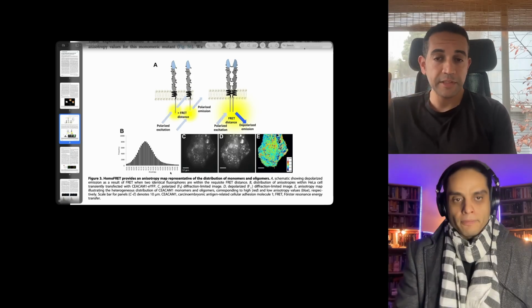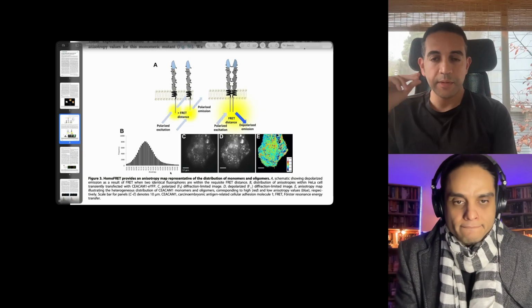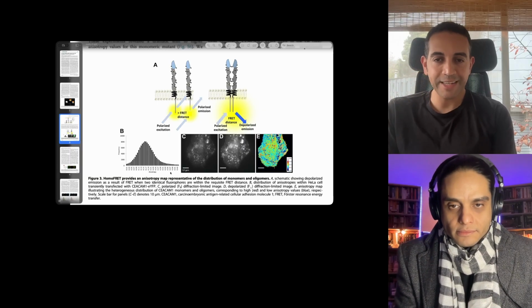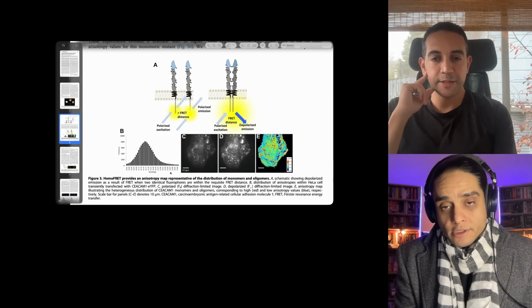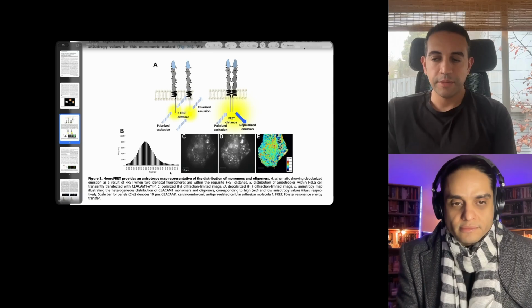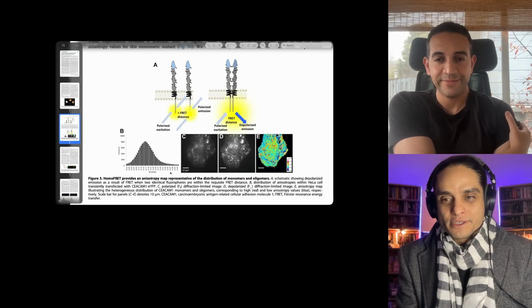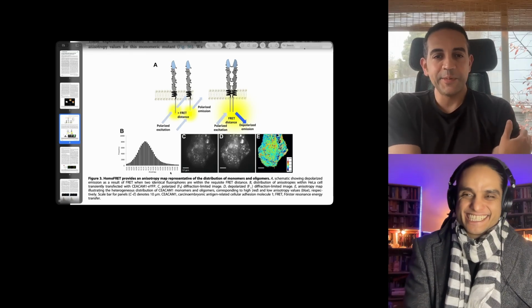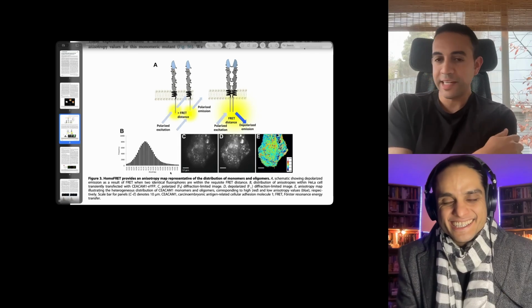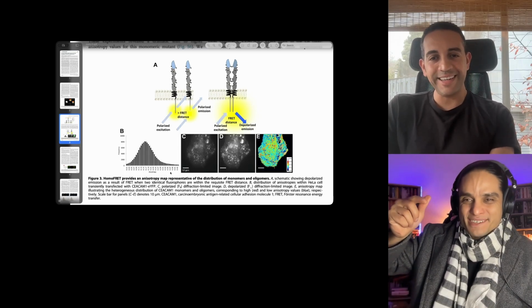Yeah, and you can imagine that's crude. That's still quite crude. And then eventually, once I get to my exact cell, you may want to do a small nano adjustment, but there's only so much you can do with the adjustment knobs that you're provided with. Of course, because we're calibrating for nanoscale with our pudgy fingers. Yeah, because you just have a dial.